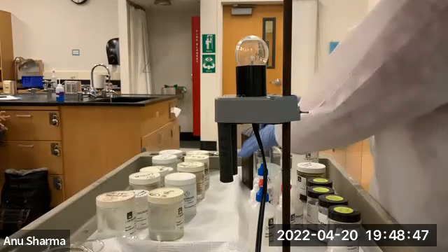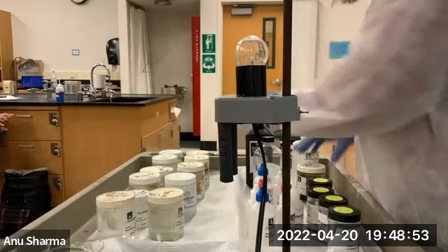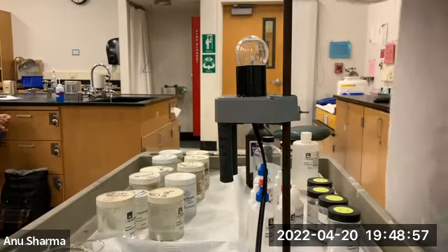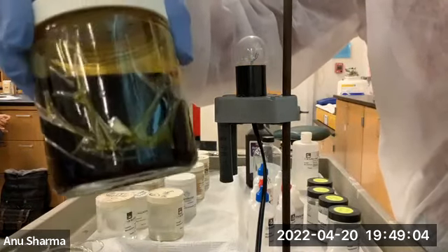Now, I don't know how the tincture of iodine is prepared, but it looks like this. I'm sure iodine is dissolved in something, but I do not know what that something is. It could be alcohol, maybe ether, I don't know.